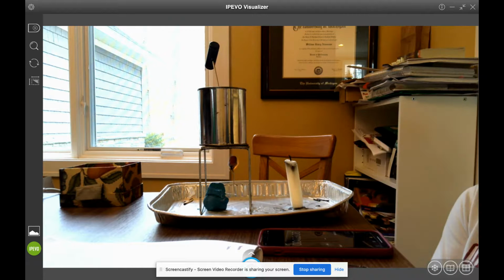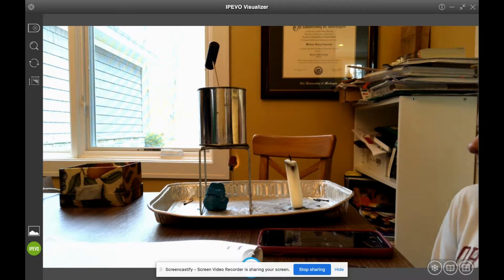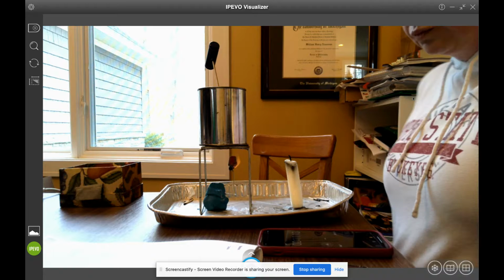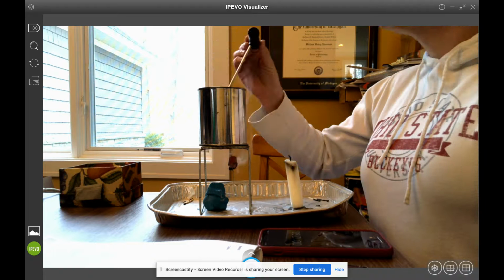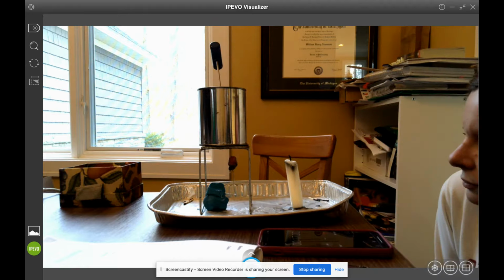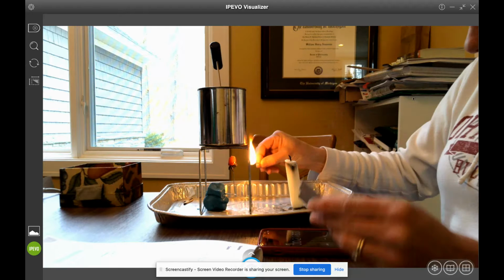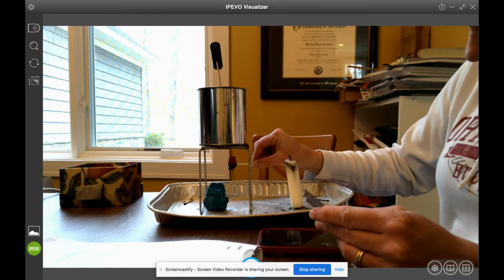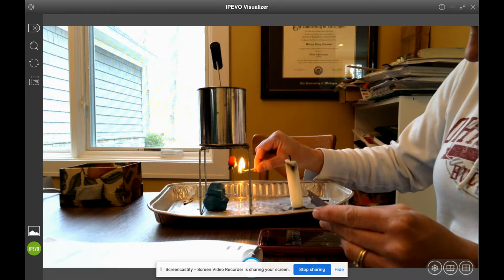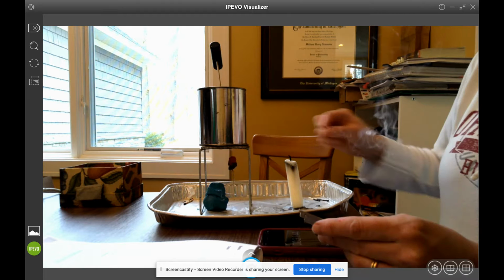We're just going to let that gumdrop burn. It's almost all the way black. The temperature is rising. Oh, I have to relight it. It said it may go out, so we want to keep it burning until it's all the way black. Oh, I blew it right out. That wasn't very good.